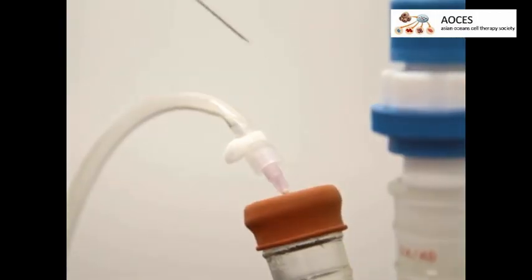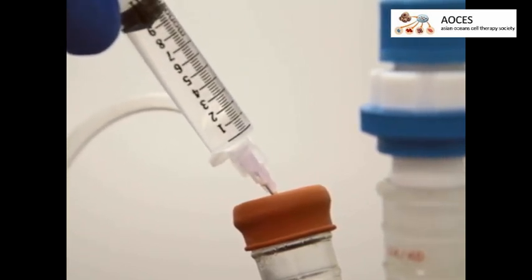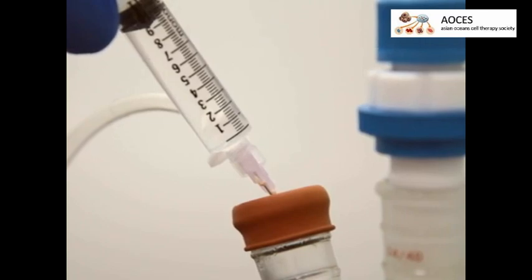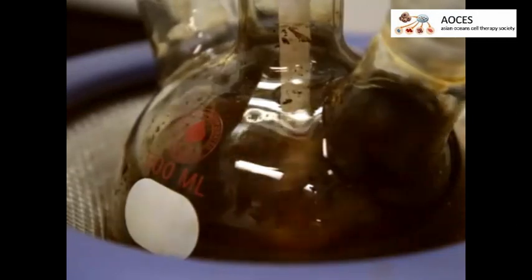Once the reaction has reached 50 degrees Celsius, use a syringe to inject 10 milliliters of 28% ammonium hydroxide through the flask septum. As the magnetite precipitates, the solution should turn black.